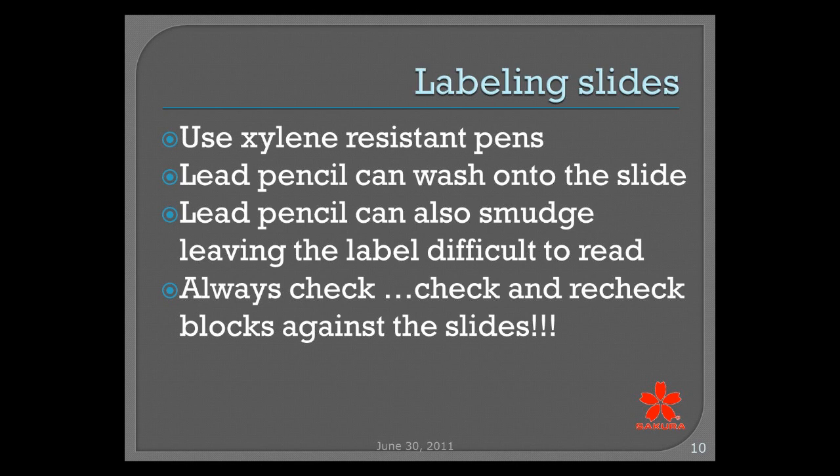I have run into the experience before where that hasn't been done, and we stick a batch of slides onto the stainer, and lo and behold, all the labels disappear. And then you have to go back and check your blocks against your slides and re-verify everything. So just test your xylene-resistant pens before you use them.